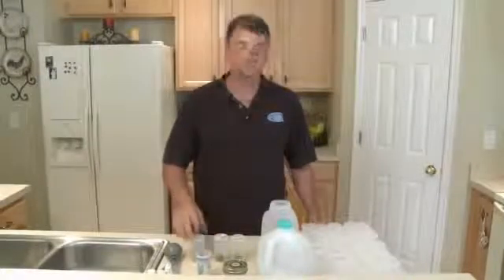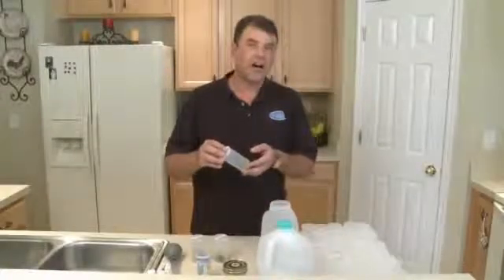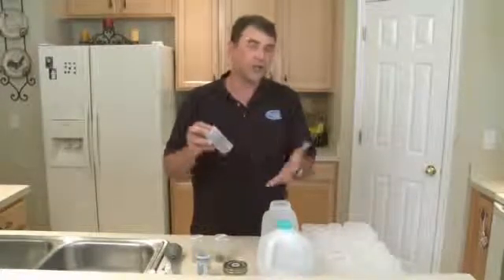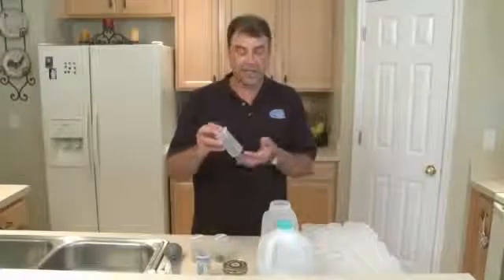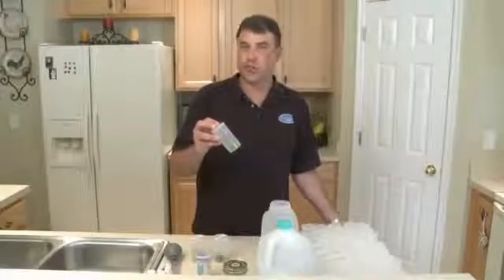We are going to make media today using the ingredients from the tissue culture kit. First, as a review for those who have just picked up the series, in microcloning we are just going to grow very small copies of plants in self-contained vessels on a media that is gel, sugar, nutrients, and hormones.